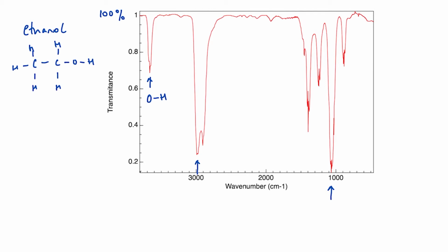So if I want to make my OH bond stretch more strongly, vibrate more strongly, it's going to be absorbing this particular frequency of infrared energy. This peak here is for carbon-hydrogen bonds, and this one down here for carbon-oxygen bonds, and you can use a data sheet to find out this information. Now, one of the things we'll notice is the x-axis is not in frequency, not as we know it, it's not in hertz, it's in wave numbers, centimeters to the -1.